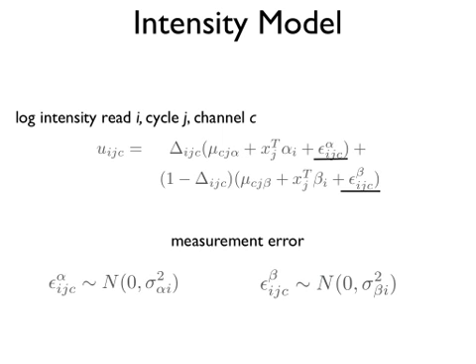So you have a line that decreases with cycle, and you have at the top, and then you'll have a line that increases with cycle. So the alpha is going to be negative because the signal is going down, and the beta is going to be positive. It's going to be going up. The bigger alpha and the bigger beta, the worse you are, because it means things are getting worse faster. So we can also use those as quality metrics for each read.